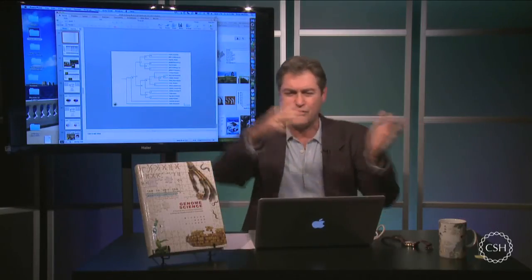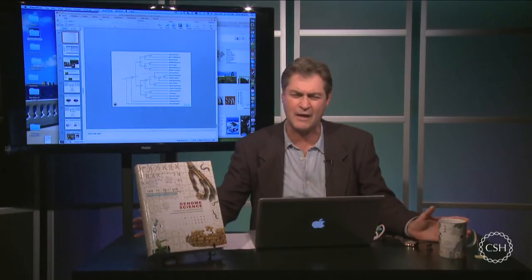Now, if they're barcodes for two entirely different regions, you're going to have a mess, because you're going to have superimposed trace files. But yes, in fact, in DNA barcoding, it's sort of rare that you can use exactly one primer forward and exactly one reverse primer and amplify a range of species. Typically, there is actually a mixture of primers there anyway. Did that answer your question?